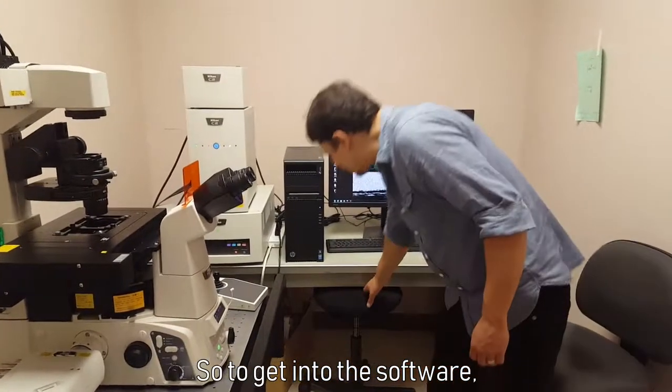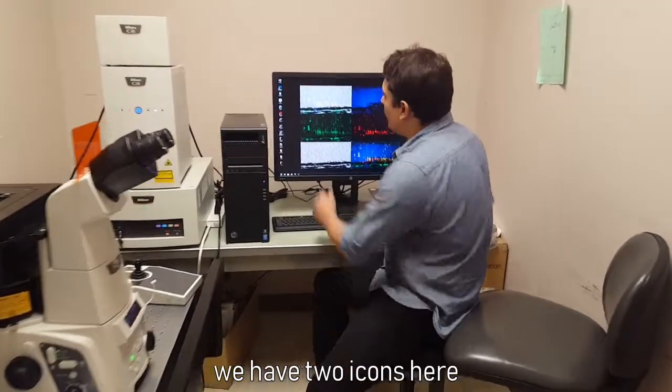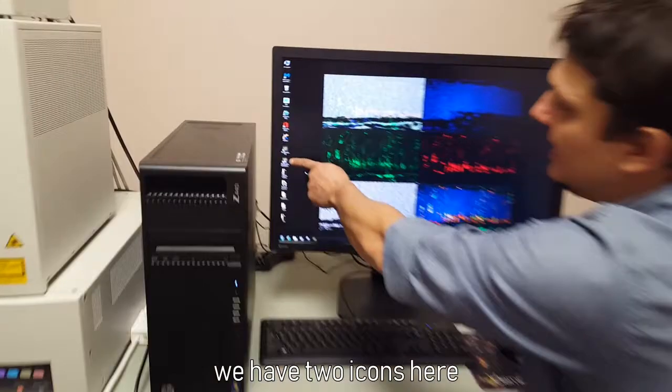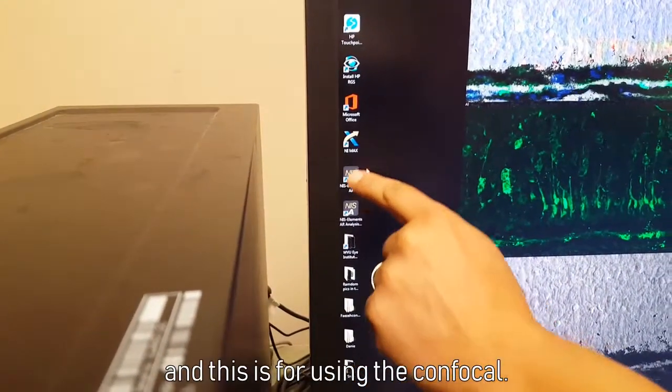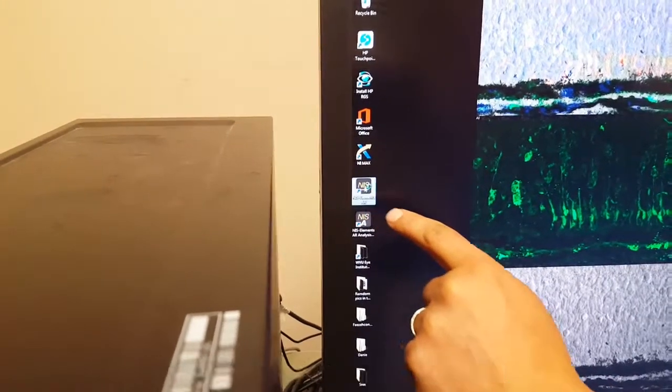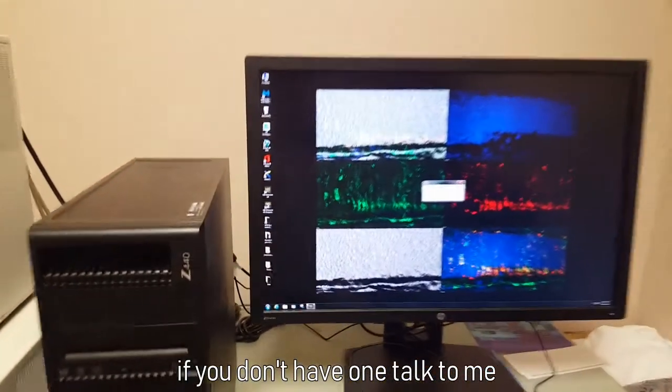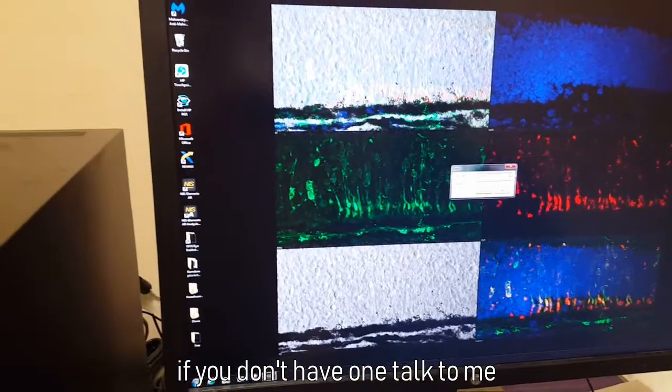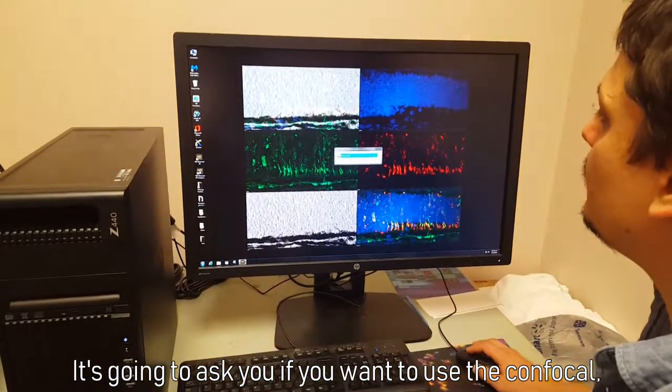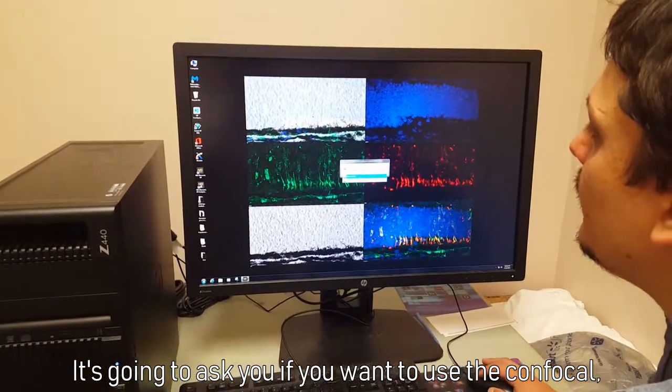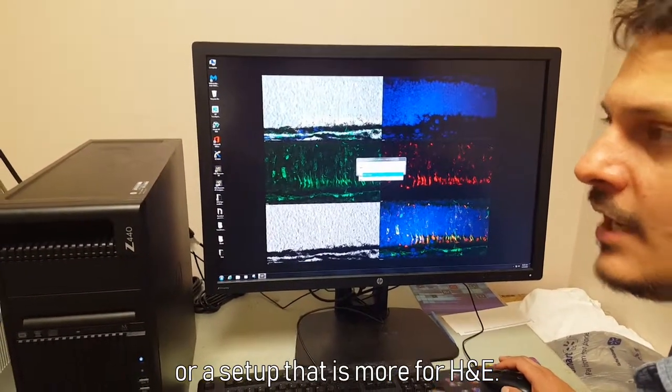So to get into the software we have two icons here. This one is just for image processing and this is for the confocal. You have to choose your user. If you don't have one, talk to me. Put your own password and it's going to ask you if you want to use the confocal or a setup that is more for H&E.